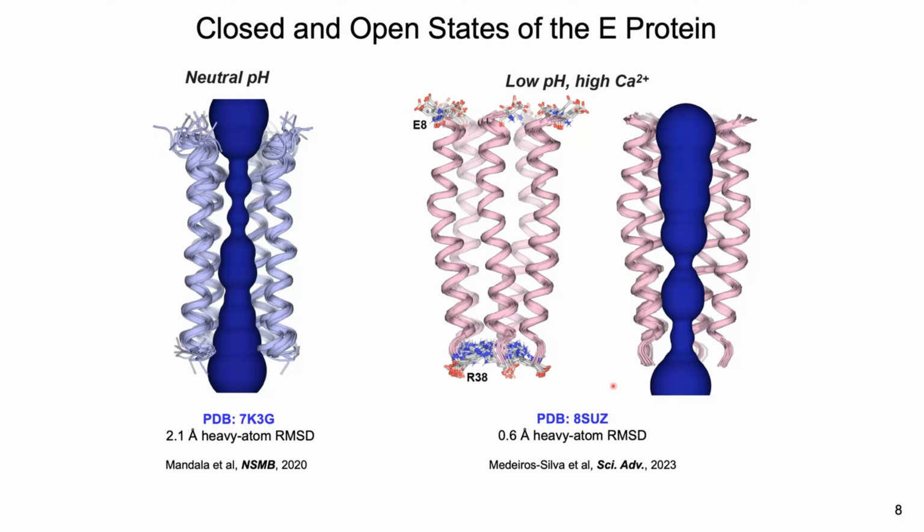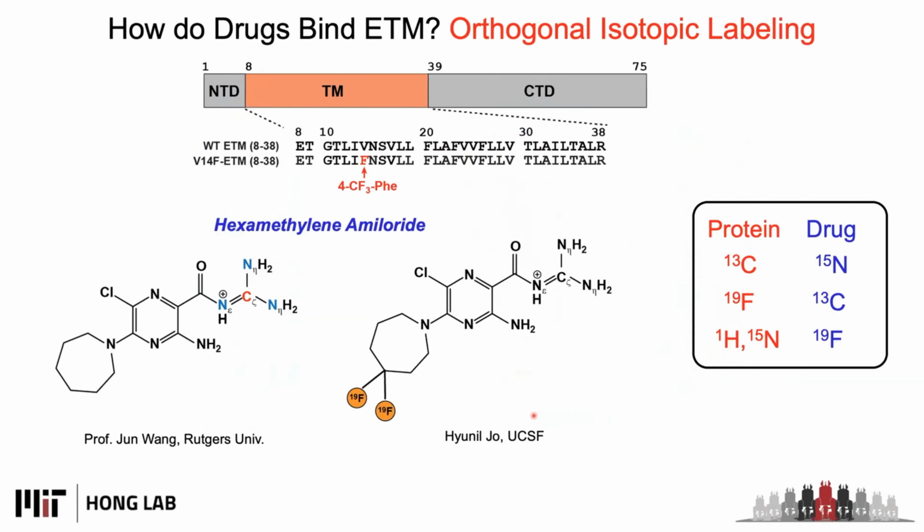The C-terminal tight region, especially at the end of the C-terminus where there is arginine, we think is important for making this channel end polar, and therefore reducing the hydrophobic gate in the middle of the transmembrane domain, so that water and ions can actually be conducted. So we have quite a bit of mechanistic insight from solving the high resolution structure.